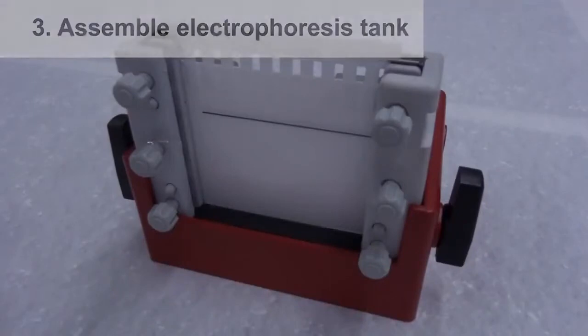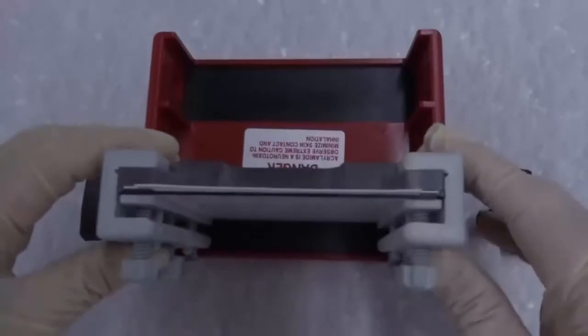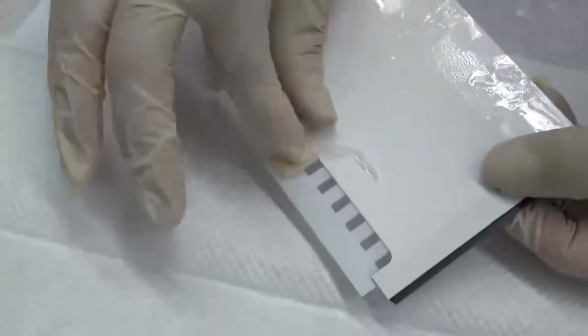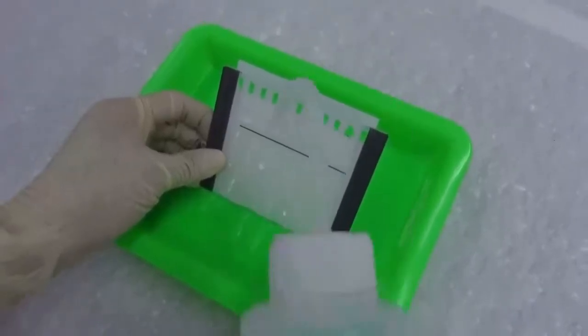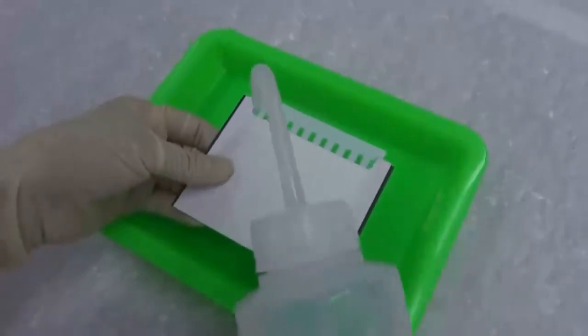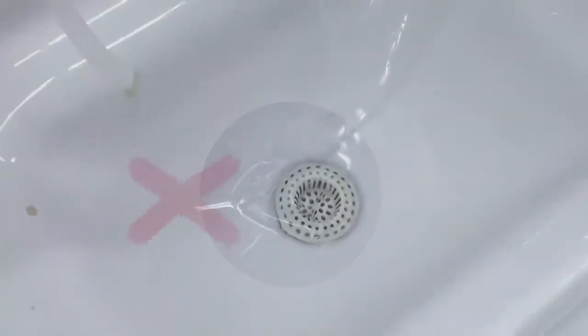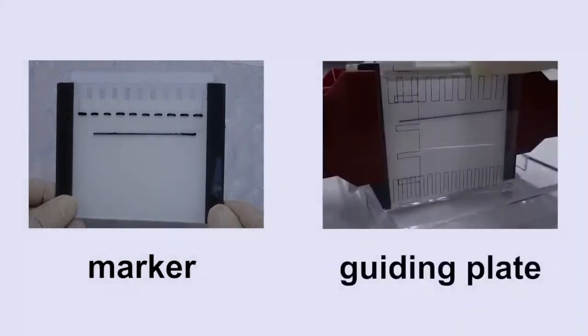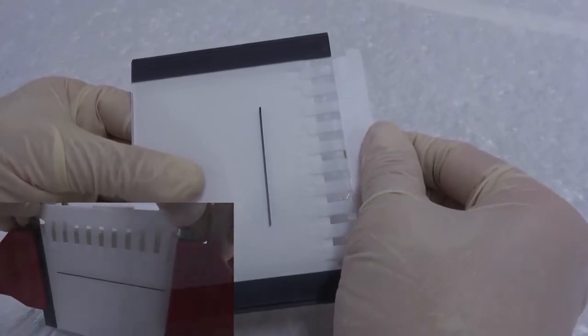Once the gel is cast successfully, twist the black knobs downward and pull them out. Push out the cassette sandwich from the bottom, remove the residual gel from both sides by hand or using a plastic card, and then rinse both sides with distilled water. To avoid clog, do not drop residual gel into the sink. You may use a marker to label and number the sample wells or use a guiding plate later.